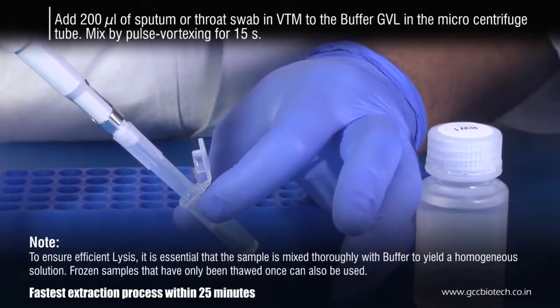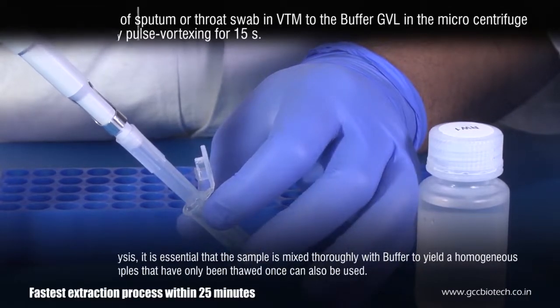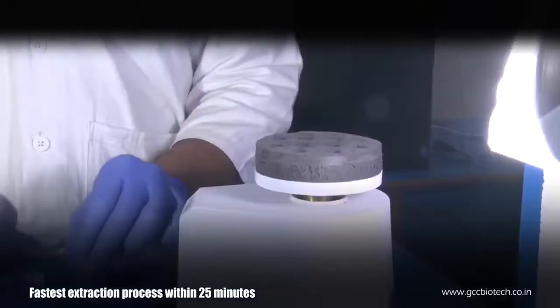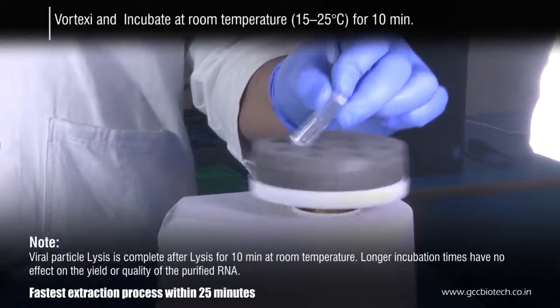For sample volumes greater than 200 microliters, increase the amount of buffer GVL proportionally. Incubate at room temperature for about 10 minutes.